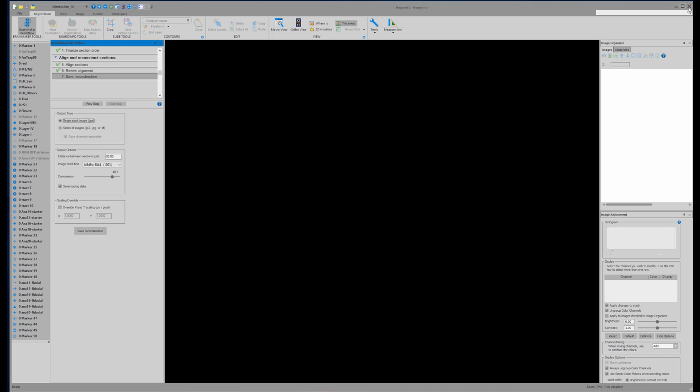And that format, Chip, allows you to have compression without losing features or a change in cell detection performance. Yeah, so there's a number of variables. We can change the compression. We could save it rather than as a JPX stack, which is JPEG 2000, as TIFF stacks, or save the individual sections, save the channels separately. It's quite a bit for a future webinar when we go through this. I can go through all the details of that, but there's quite a bit of variability in how we do this. Okay, so that's just to demonstrate how the BrainMaker part of this works.